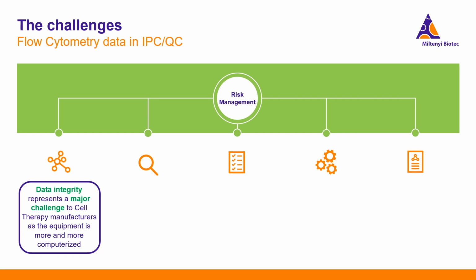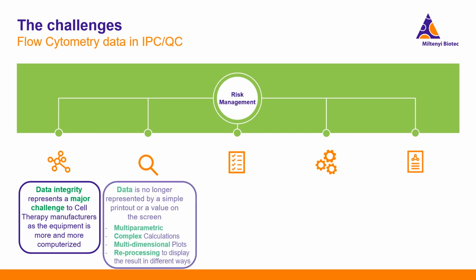First of all, data integrity represents a major challenge to cell therapy manufacturers as the equipment is more and more computerized. Data is no longer represented by a simple printout or a value on the screen. Data is multiparametric and complex, it requires calculations, there are multidimensional plots to be interpreted and considered, and reprocessing to display the data result in different ways is required.